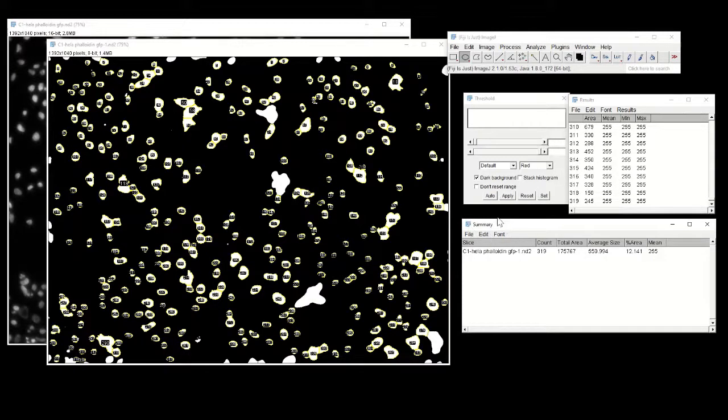And we're going to start with a summary. Actually, no, we're going to start with this image. In this image, it actually physically shows you which circles or which areas it actually counted. And each one of these areas is associated with a number. You'll see in a second what this number actually means.